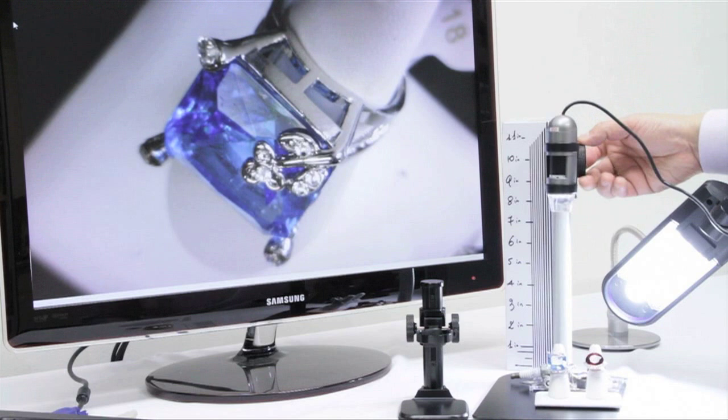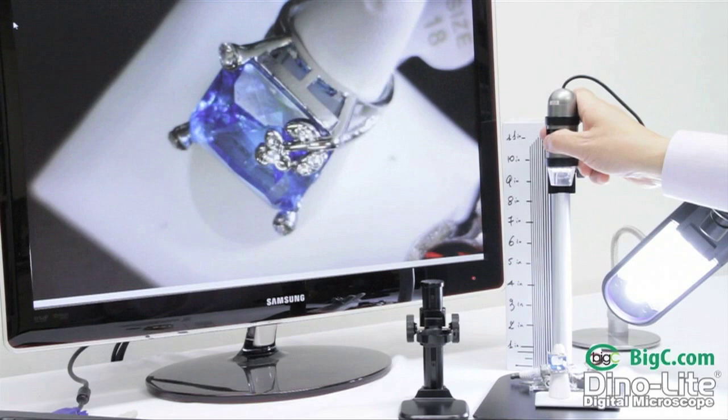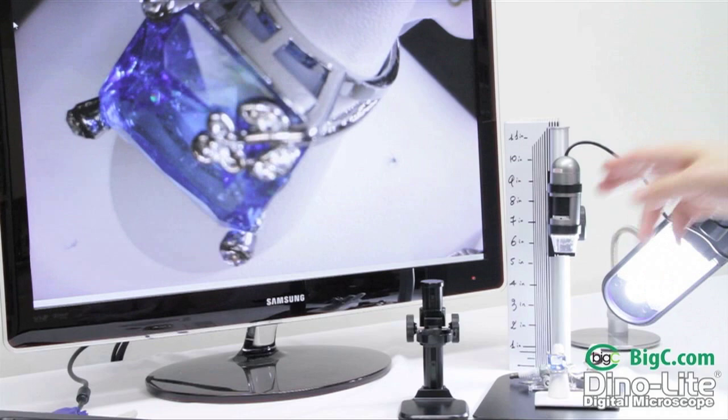As we're demonstrating here, we can move the microscope back a little bit and get 10 times magnification into focus. Then if we want to zoom in, we move the microscope down towards the object we're looking at and refocus the image.